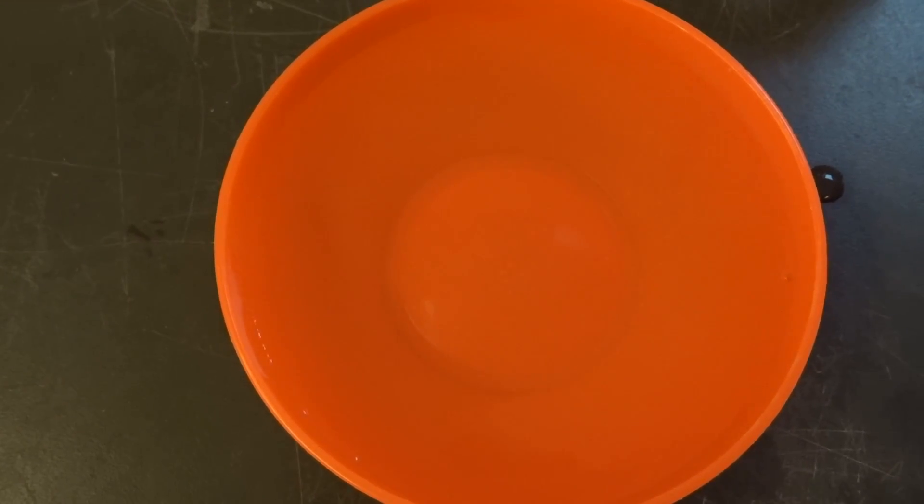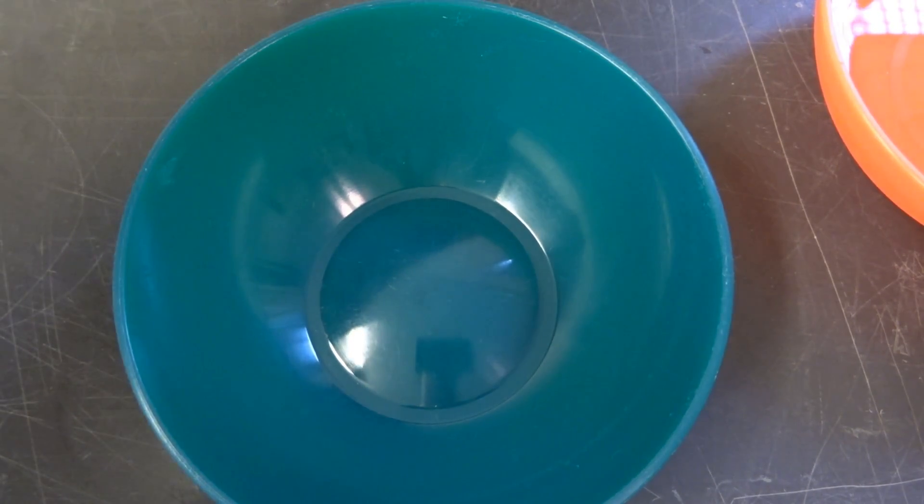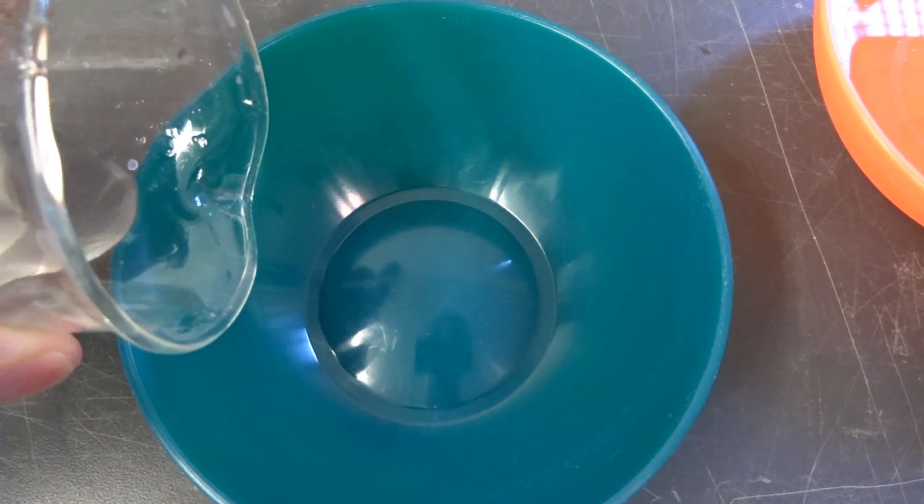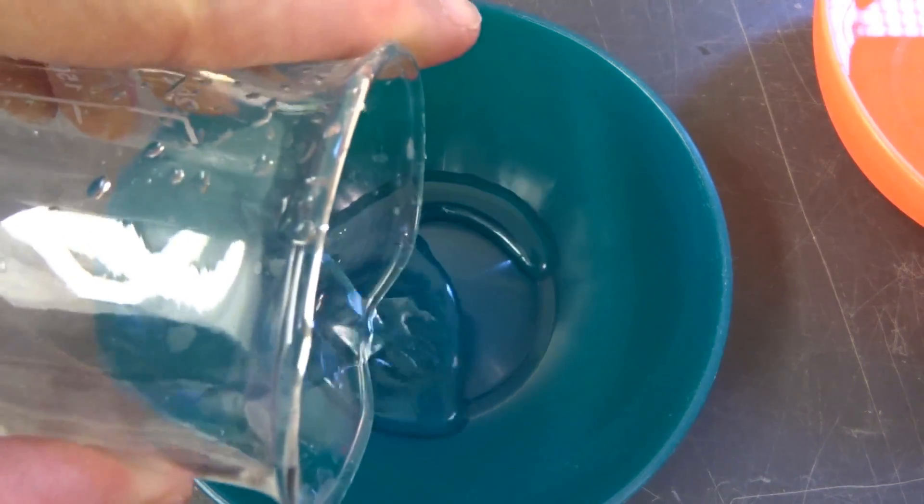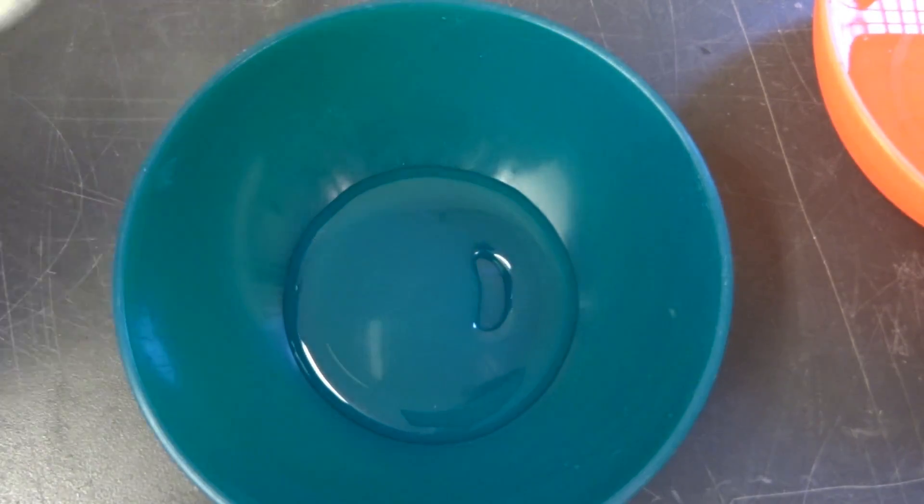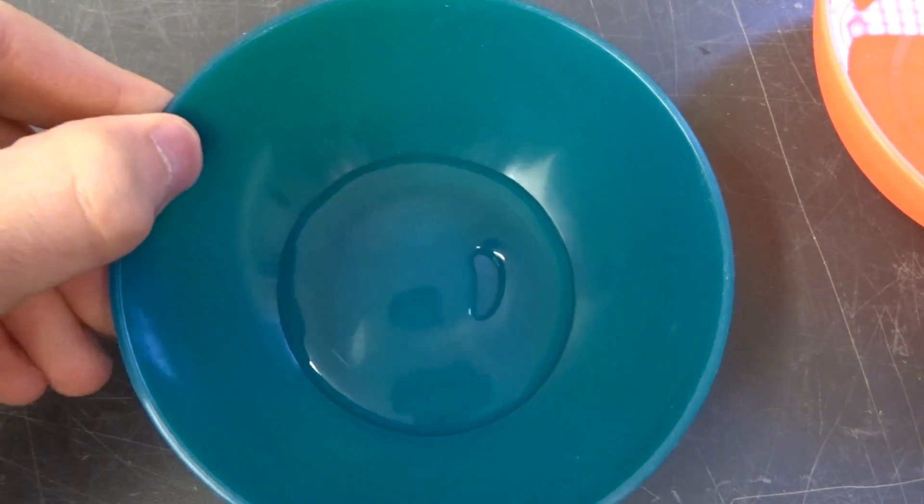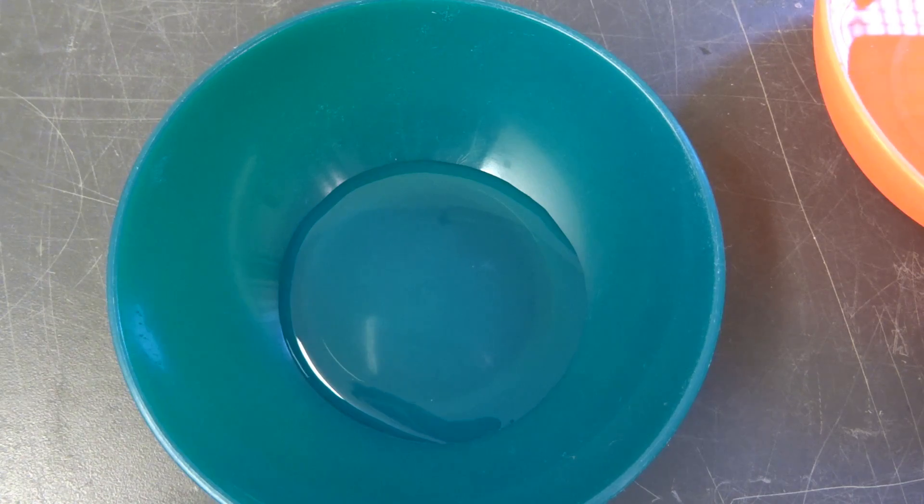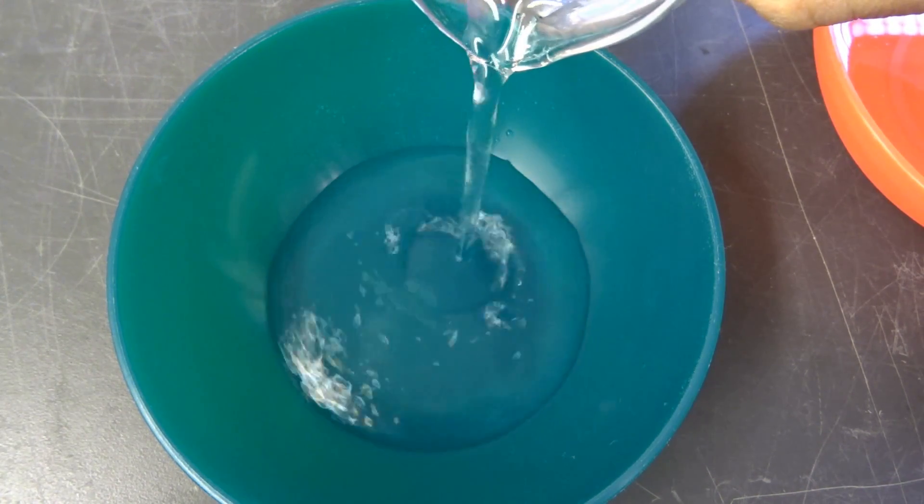So this was round one, and I can already tell you this one didn't work out. Here is round two, and I again cover the bottom of this little dish. And round two will actually make the gel that you saw in the beginning, so the red gel.